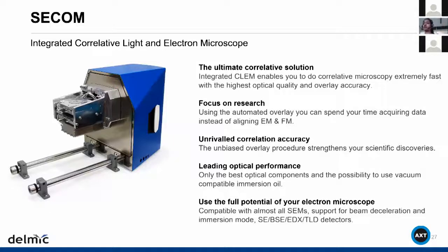So there's also support for beam deceleration mode, immersion mode in the SEM, and for using a variety of detectors like the secondary, backscattered, EDX, and in-lens detectors.